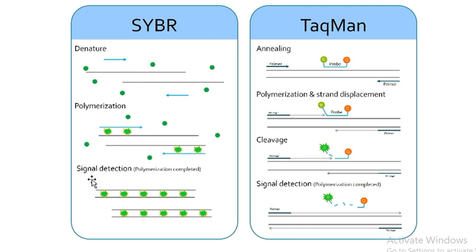With this we will understand, okay, now the denaturation process is happening, because we are not seeing the fluorochrome, because in the denaturation we are breaking the bonds between the templates. Now a little fluorescence is seen when the annealing happens, because primers have only 3 to 5 to 10 hydrogen bonds, but the extension of the DNA happens with complementary bonding.